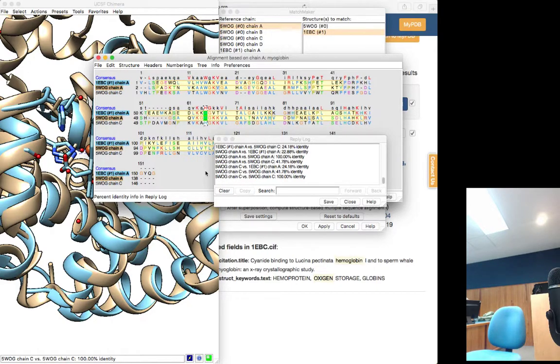Because here we are comparing A and C, which will be alpha and beta, this should be very similar to the value that you reported in your test when you got the beta subunit. Some got delta and somebody got gamma, but you should have very similar values. So why do I like Chimera so much? Because it lets you do this. Align sequences, align structures, and compare the information from known sequences to the known structures.